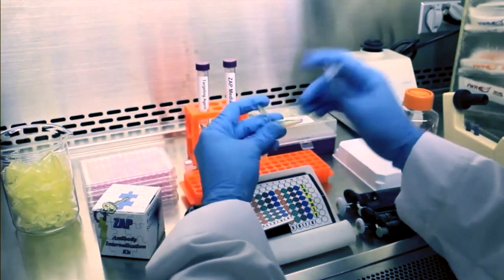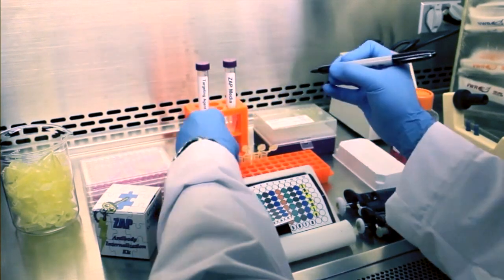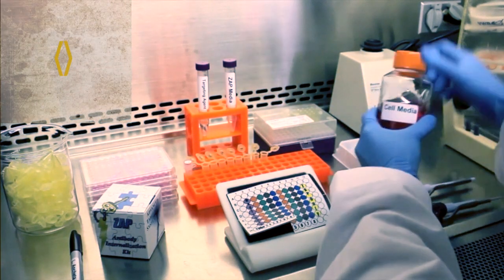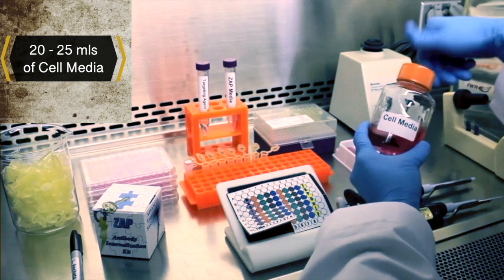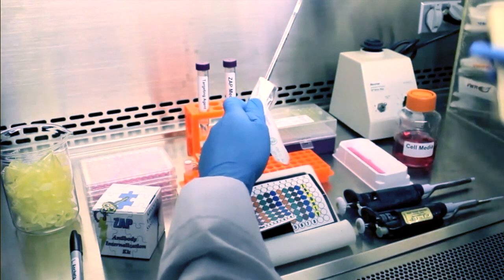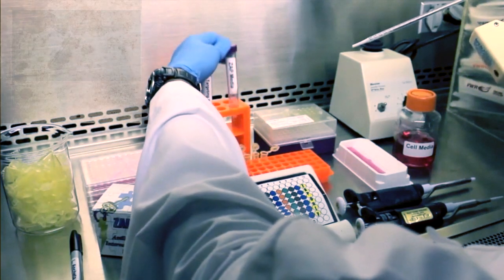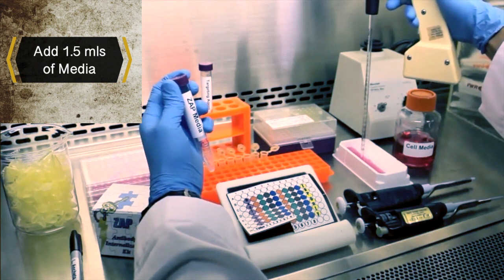The first step is to label the microcentrifuge tubes 1 through 8. Then, transfer roughly 20 to 25 ml of cell media into your well reservoir. Next, take your tube labeled ZAP media and transfer 1.5 ml of cell media into this tube.